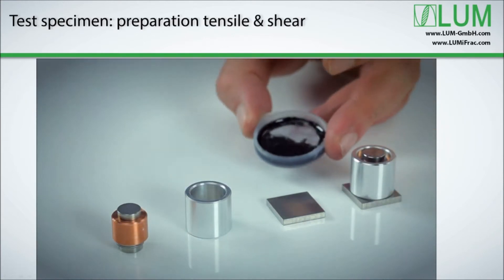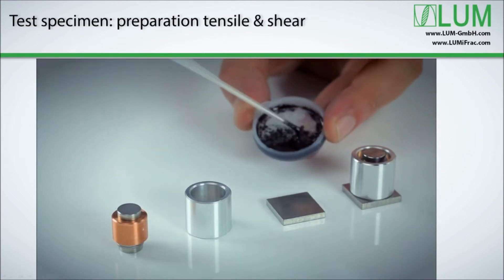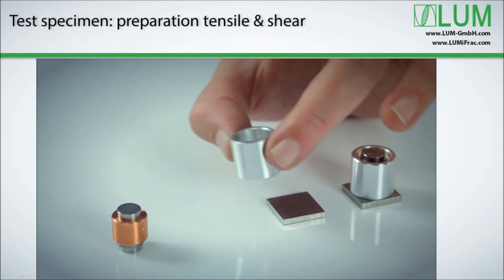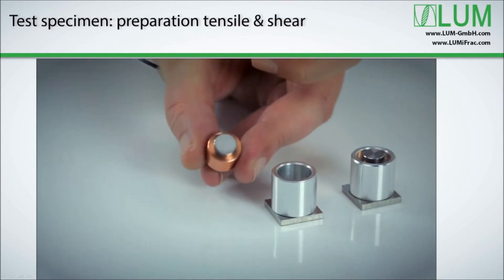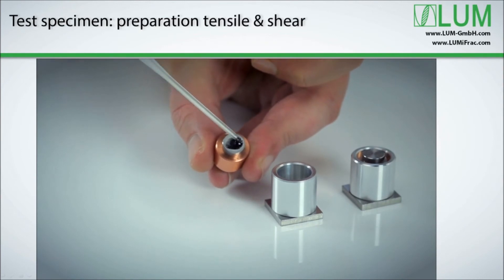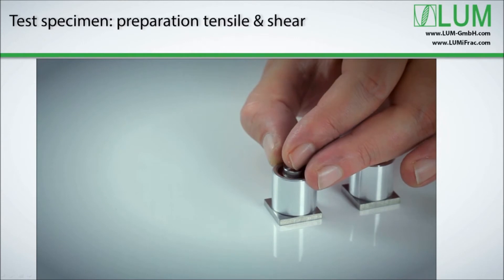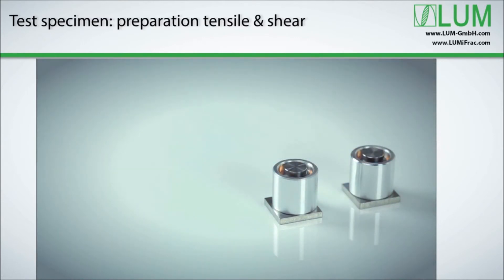Here you can see how that works in real life. First, the adhesive is applied onto the test stamp's adherent surface. Now the test stamp is inserted into the guiding sleeve, which has been placed on the sample surface. The test stamp is moved downward and attached to the substrate. During the joining process, the stamp is guided by the sleeve.